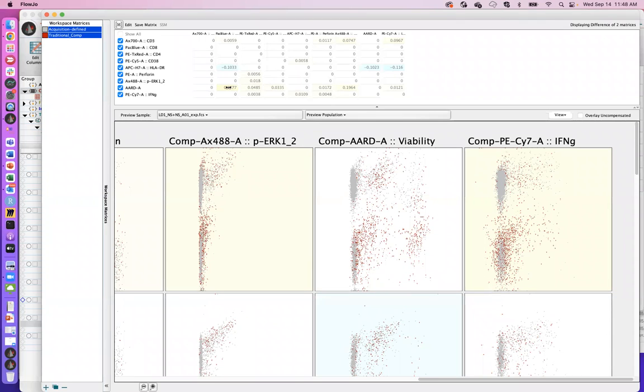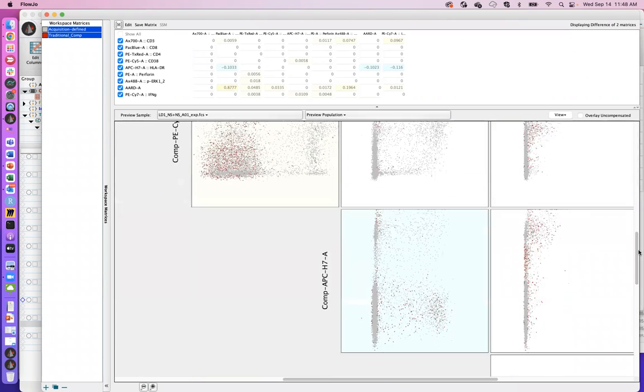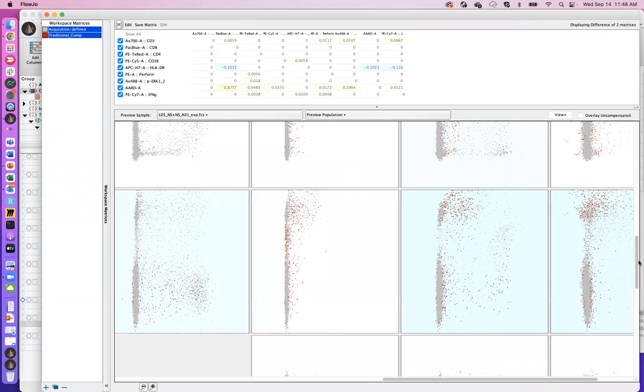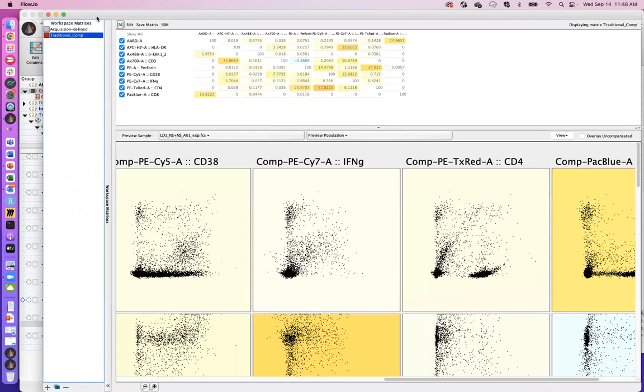And if you look at the panel that we have above here, the largest difference is in AARD, right? We have almost a 1 point difference in one matrix versus the other, but when we actually output this, that 0.8% difference doesn't really impact the data significantly. Okay, so we have equivalent matrices essentially in both. Okay, so that's traditional compensation.